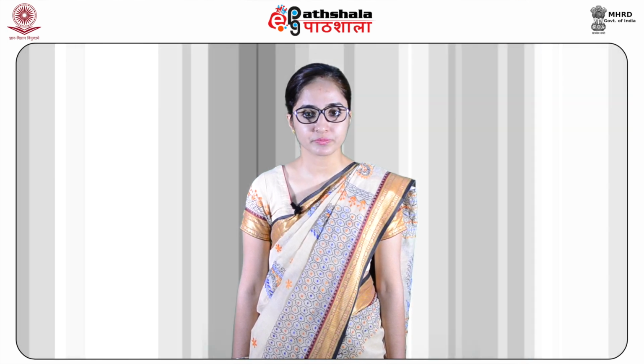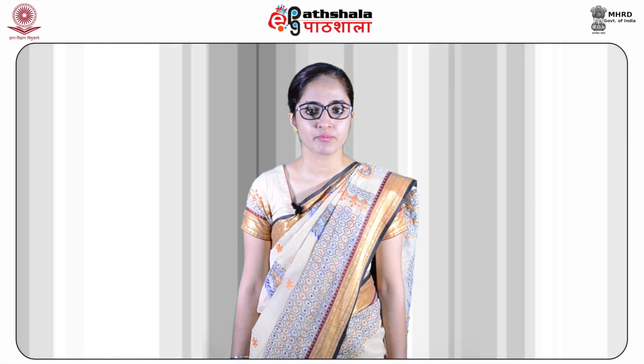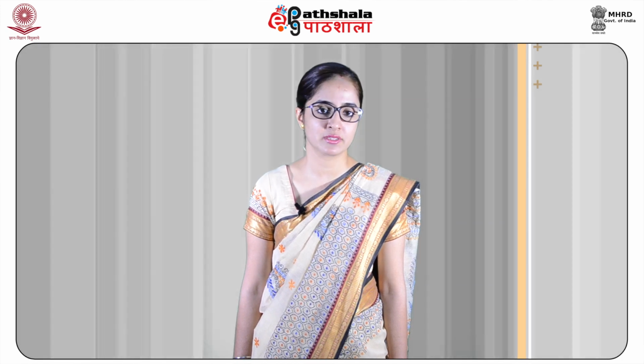Each cross peak has x and y coordinates. One coordinate corresponds to the chemical shift of a proton, the other to the chemical shift of the proton to which it is coupled. Because the diagonal splits the COSY spectrum in half, each cross peak is duplicated on the other side of the diagonal with the same coordinates in reverse order. Therefore, we need to examine only one half of the cross peaks.